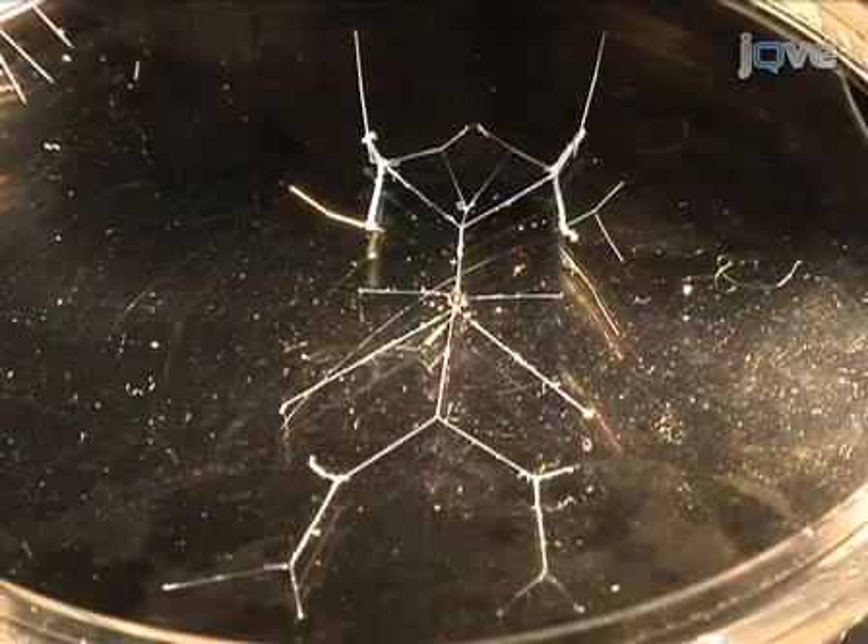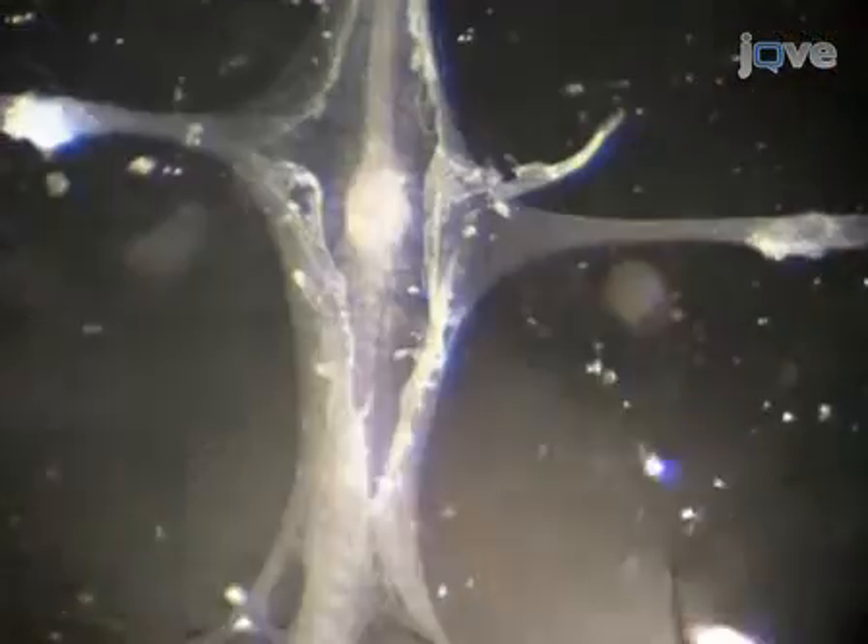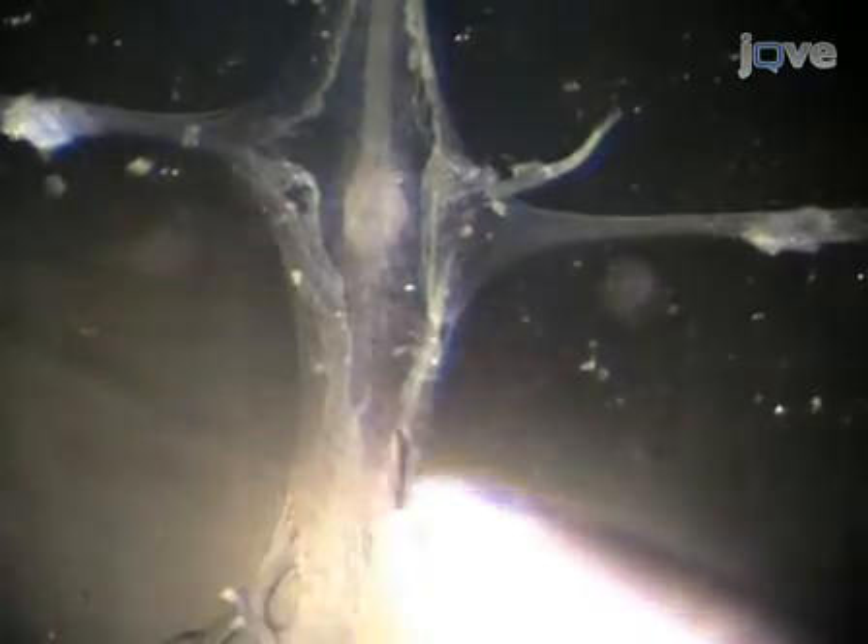My name is Rachel Graschow from the Martyr Lab at Brandeis University. And I'm Gabrielle Gutierrez, also from the Martyr Lab. Today we will show you a procedure for dissecting the stomatogastric nervous system from the crab cancer borealis. We use the crab STNS in our laboratory for electrophysiology, immunohistochemistry, and cell culture experiments.